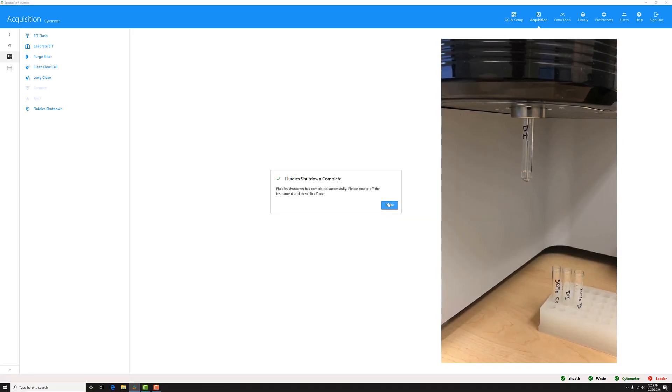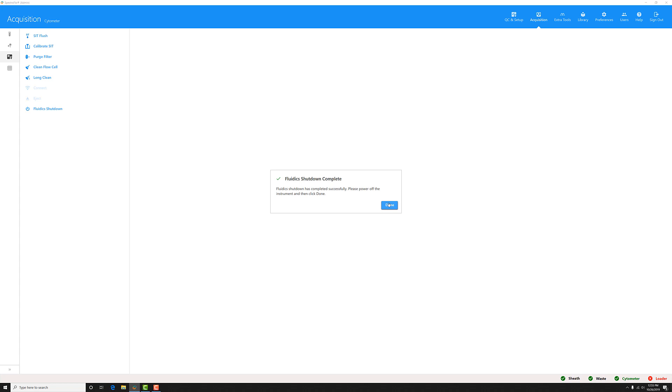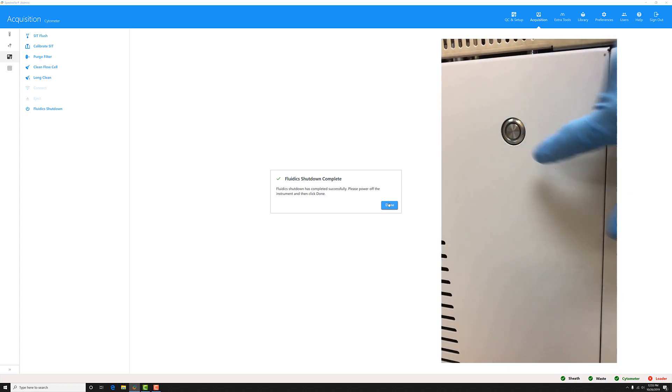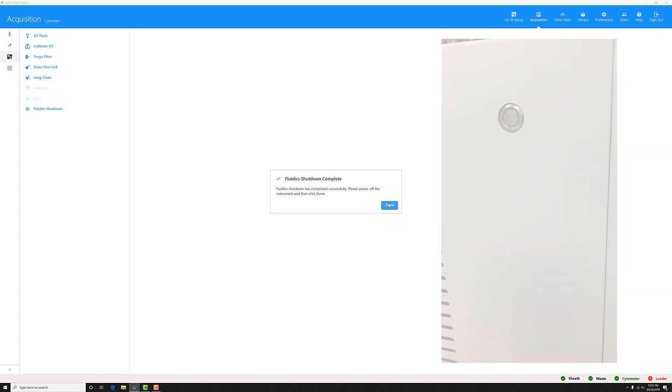When the shutdown is complete, go ahead and hit the power button on the side of your instrument to turn it off. If you have a loader, go ahead and turn the power off on the loader as well. Then you can shut down your computer.